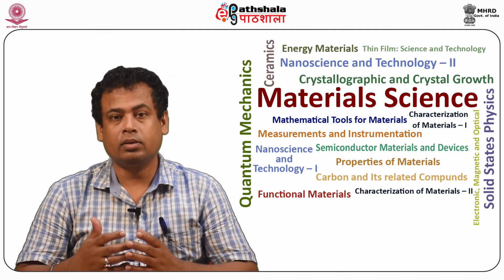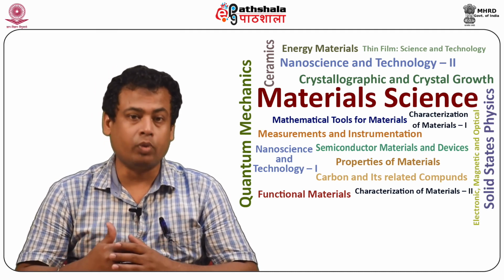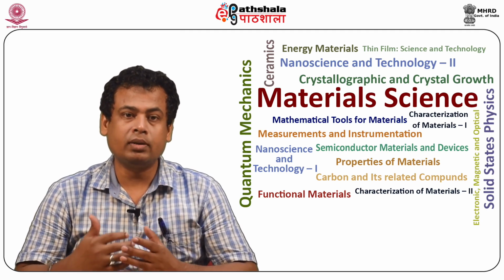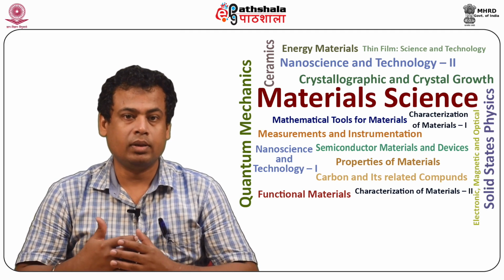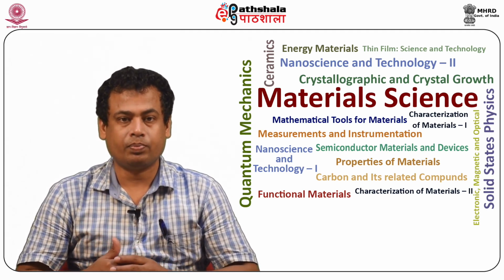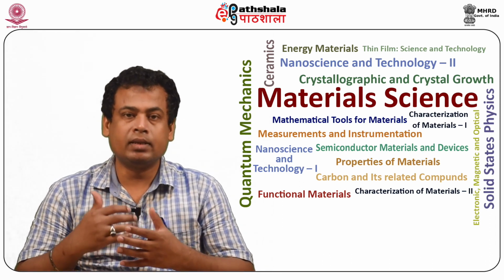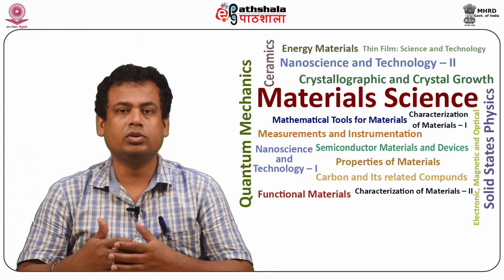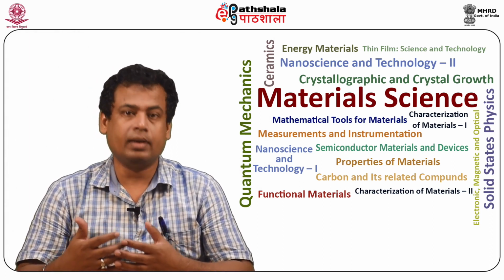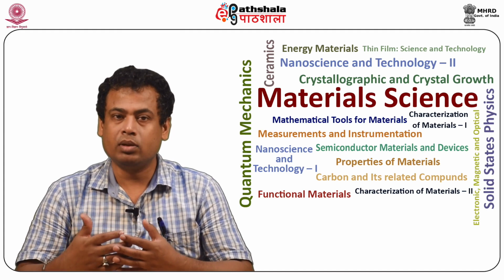Lanthanum hexaboride or cerium hexaboride, these are thermionic emission guns. It is the most common high brightness source. This solid state crystal source offers about 5 to 10 times the brightness and a much longer lifetime than tungsten.